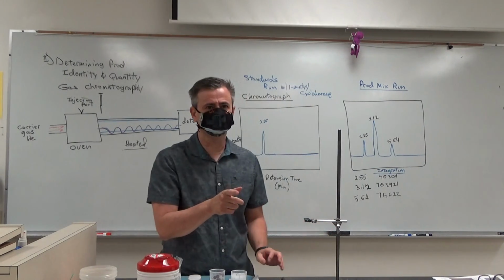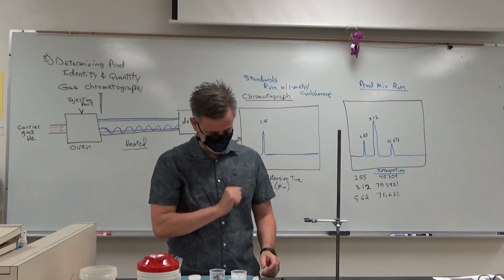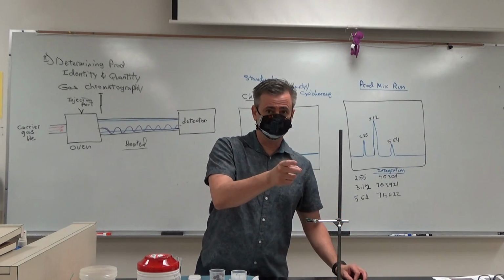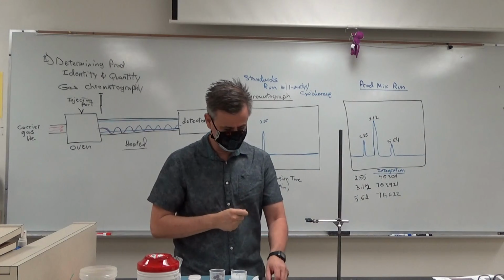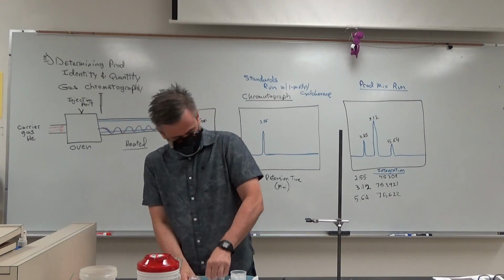Was it you who didn't have a partner? Who didn't have a partner last week? You did, okay. Maybe you. Yeah, I'm gonna share with her. Okay, perfect. And we will get you some product. Which one did you do? 2-methylcyclohexenes. 2-methyl. So we need somebody that has a bunch of 4 that can lend something to each. Okay? All right. Okay, so silica gel.